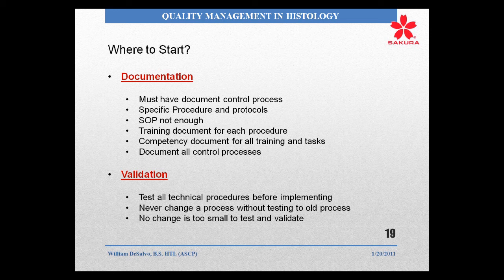My question, most often to everyone, is why aren't you doing the same level of quality control, quality assurance, and quality validation that you do in that area of the lab for the rest of the lab? And that's the level that you need to bring to the rest of your histology lab. Test all your technical procedures before you implement.